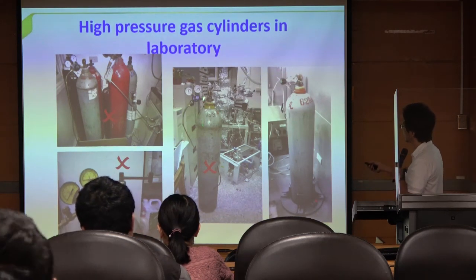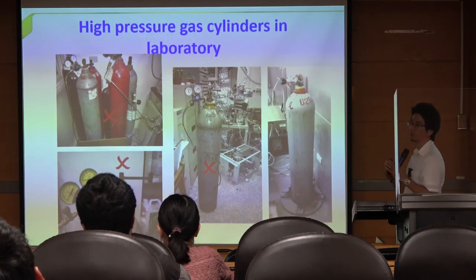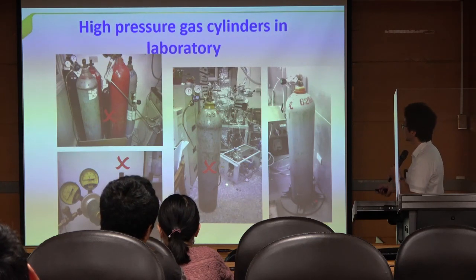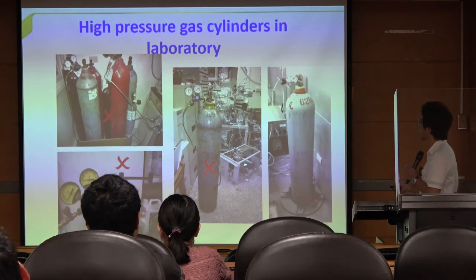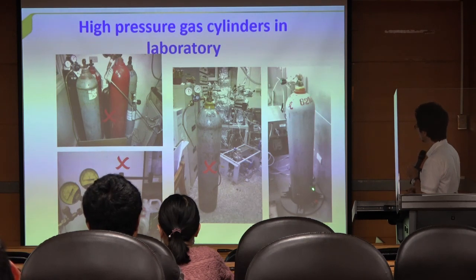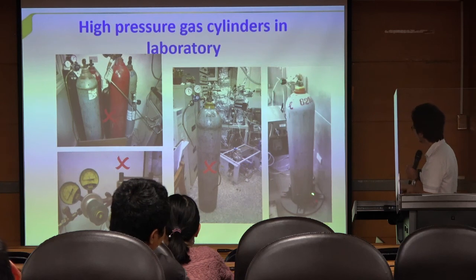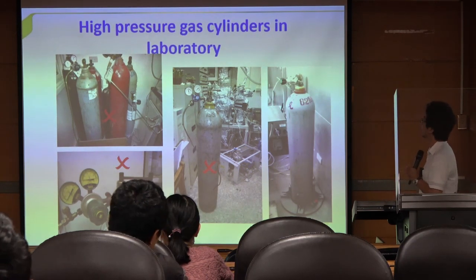Then this one is more dangerous than that one, because they are put side by side, but this one is standing individually, so it will fall down, maybe damage your equipment or yourself. So they need to be secured by a stand, to make sure they will not fall off. Okay.